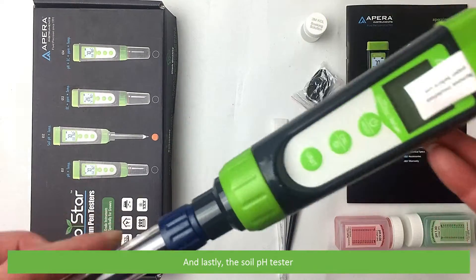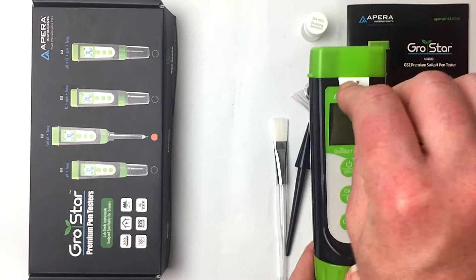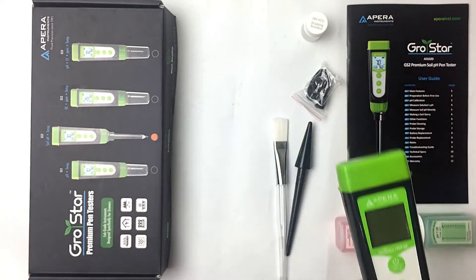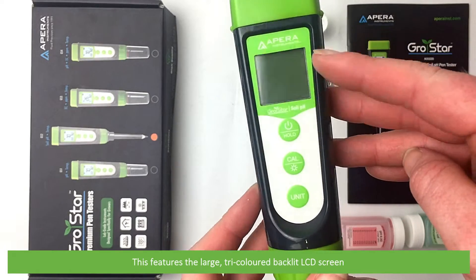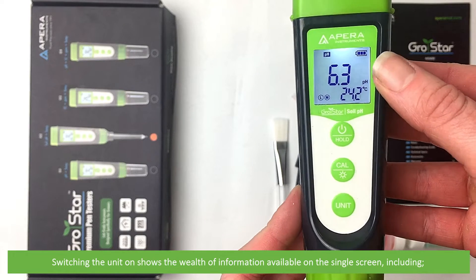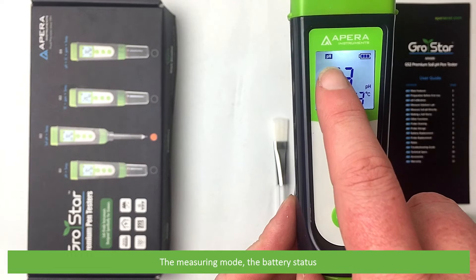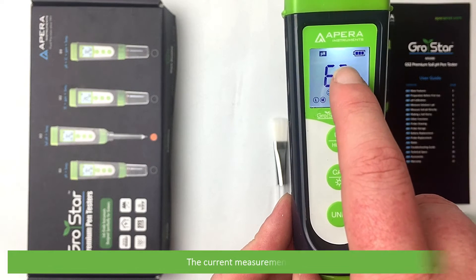And lastly, the soil pH tester itself. This features the large tri-colored backlit LCD screen. Switching the unit on shows a wealth of information available on the single screen, including the measuring mode, the battery status, and the current measurement.